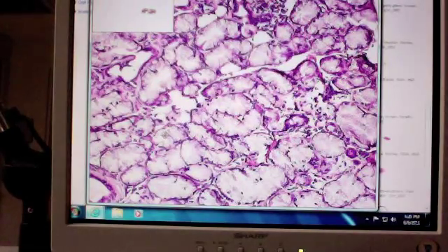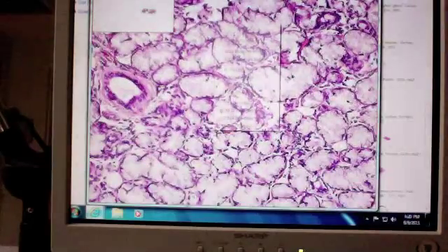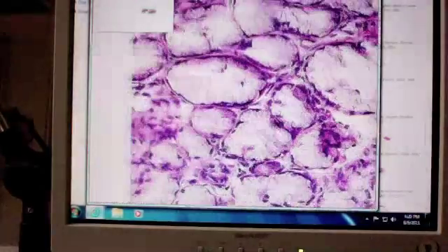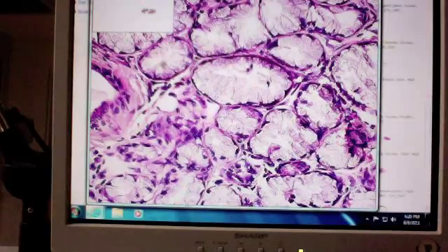Yes. What are the darker edge cells on the edges of them? Right. Very good question. So now we've got darker cells on the edges of them. We go up to higher power. Now, first of all, before we talk about the darker cells, where are the nuclei of these cells? All the way on the bottom here.